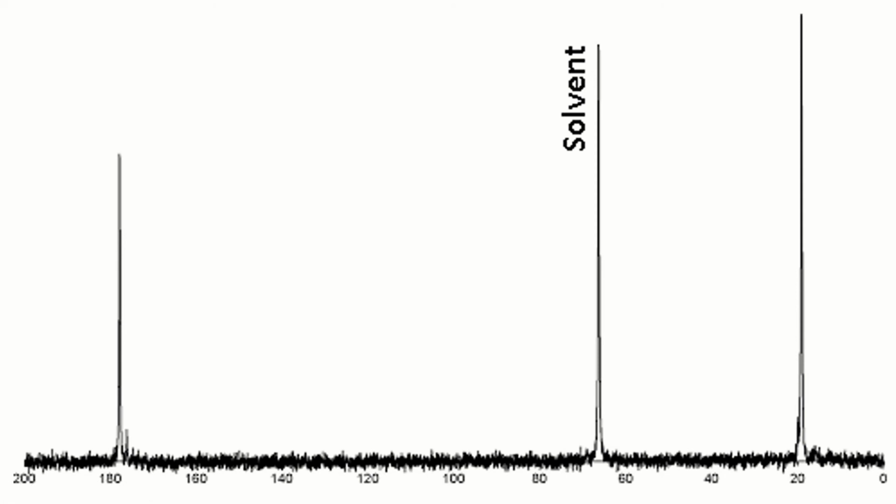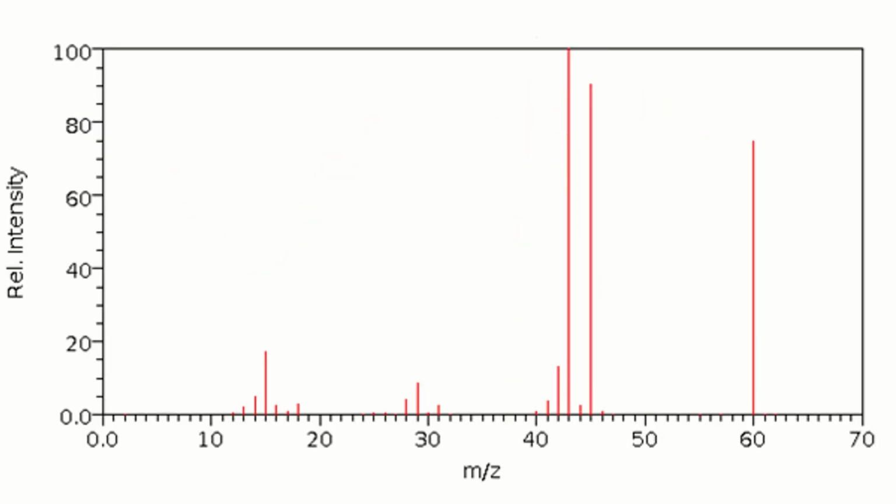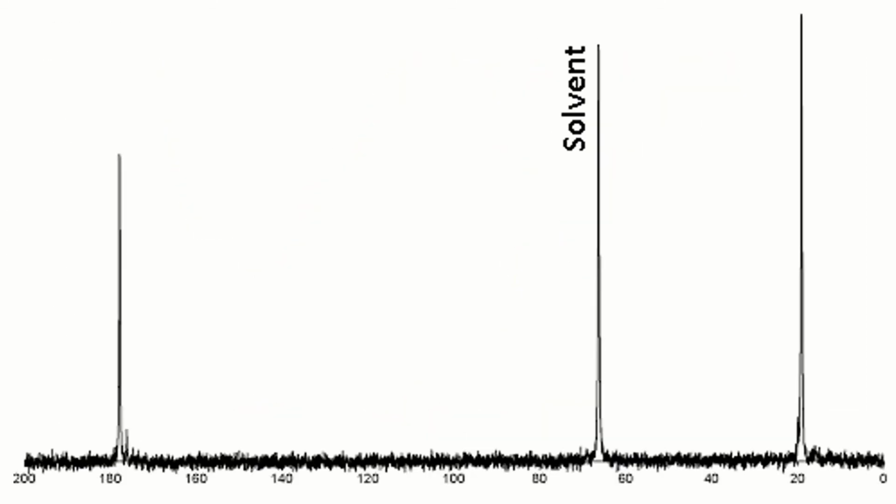Hello chemists, I'm going to take you through identifying an organic compound from the three spectrographic graphs we have been studying so far. As you can see, we have all three graphs here. We do not know what the compound we're looking at yet is. However, based on our knowledge about these graphs, we can start putting some information together.